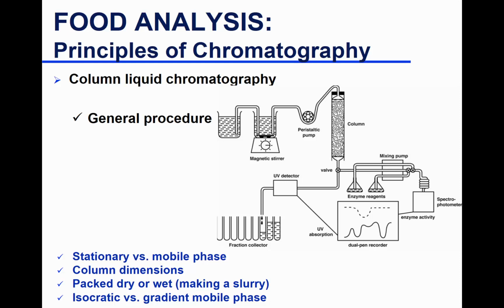Then your compounds are going to interact with your stationary phase, but now you want them to come out, and come out before time to go home, or before lunch, or something. So you do something we call increase the strength of your mobile phase. Increase its power so that it can pull these compounds out of the stationary phase. In order to increase its power, you go ahead and add organic solvent.